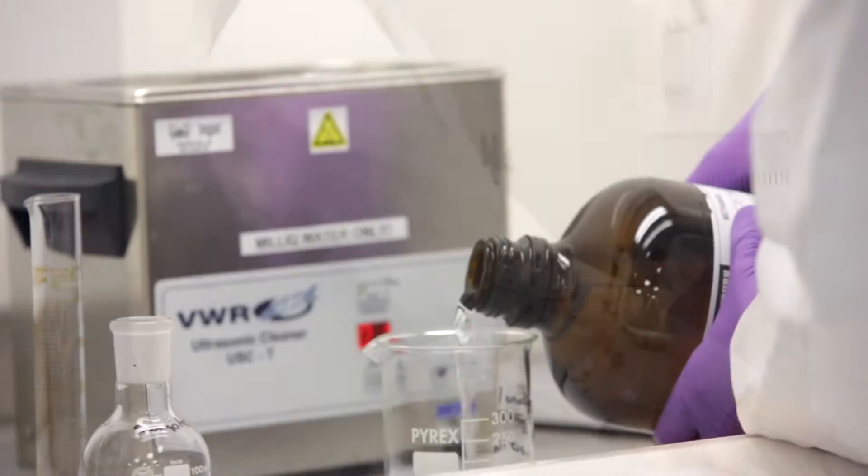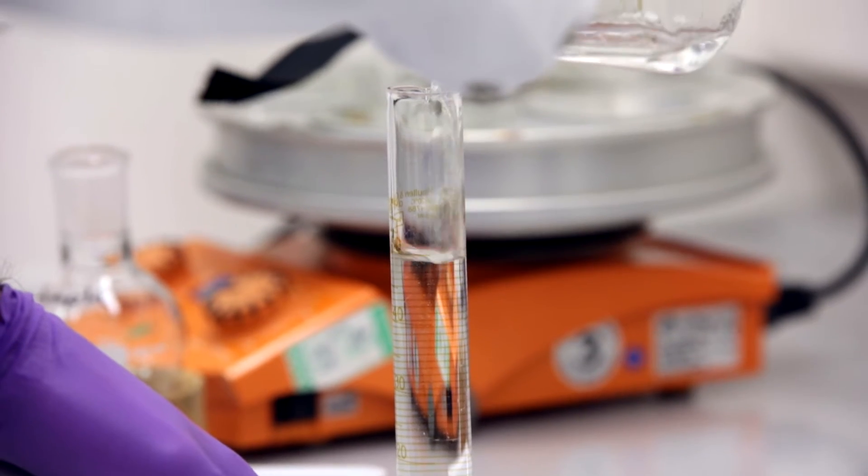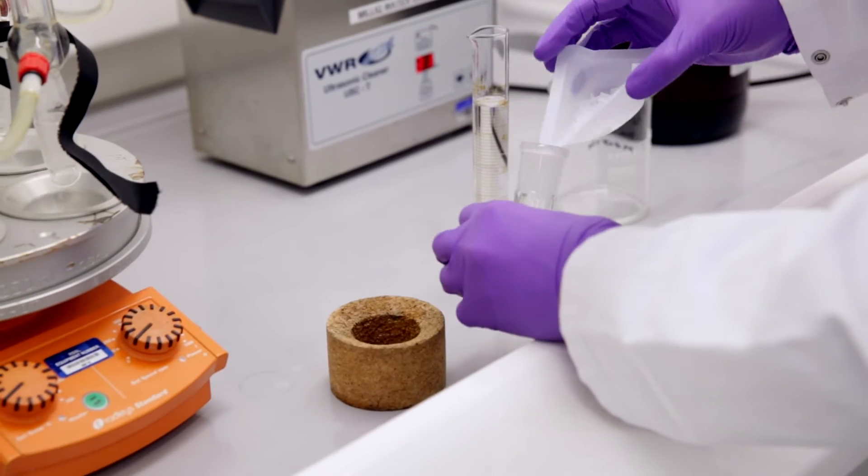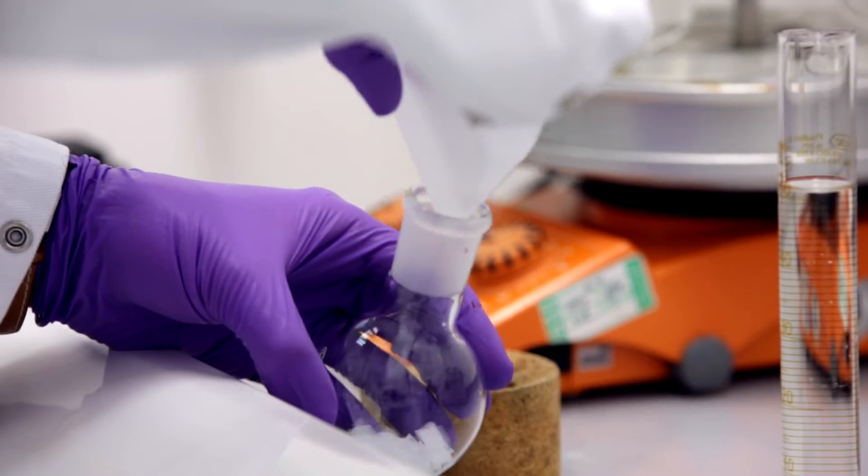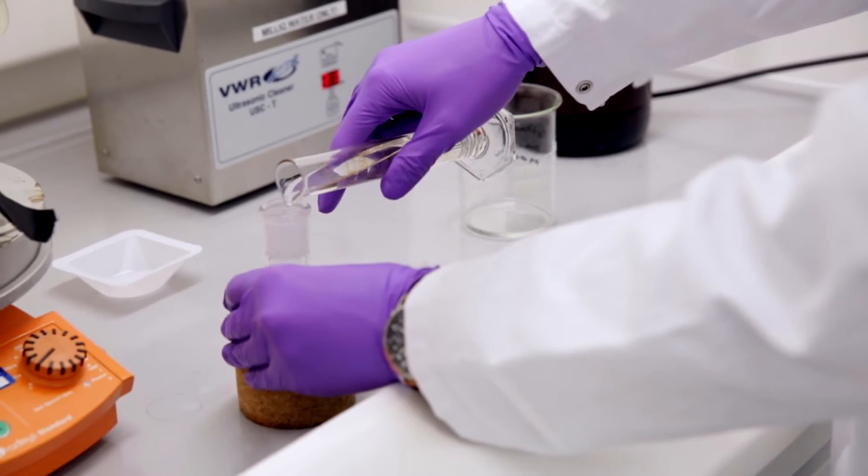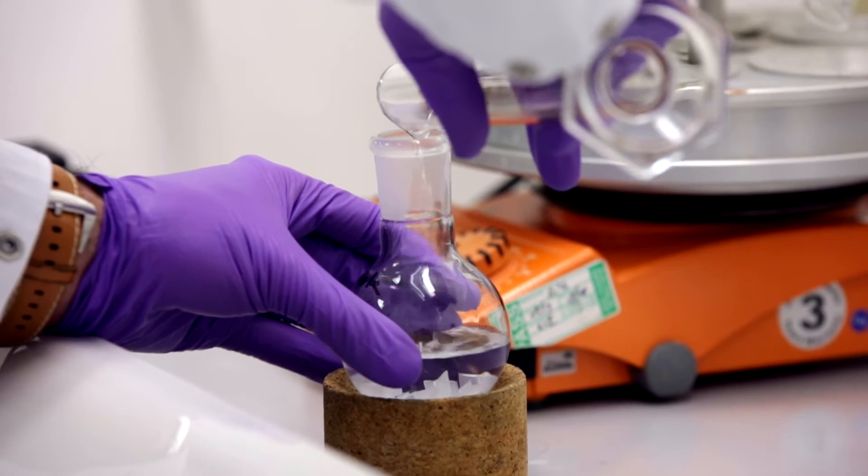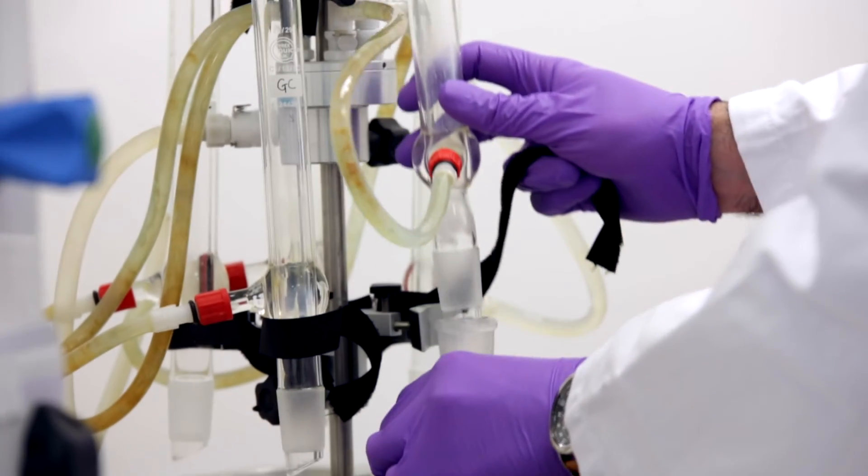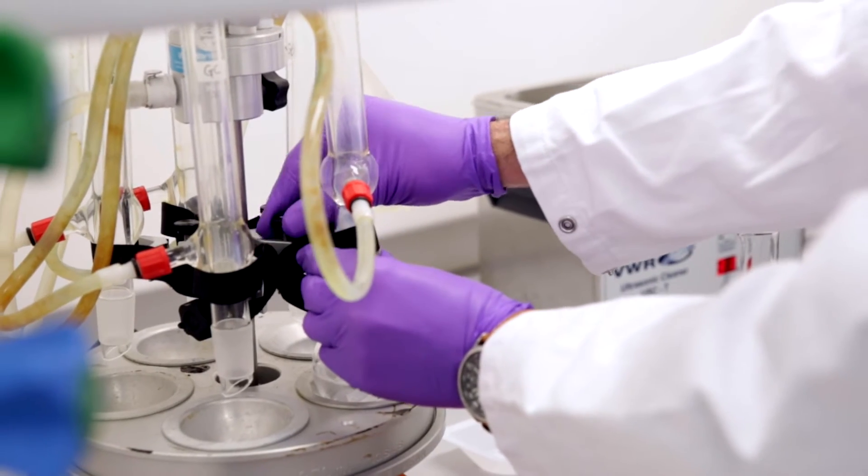The extractable study focuses on determining the chemical compounds present in the plastic cap that have the potential to leach into the drug product. To ensure complete extraction, the surface area of the sample is increased by cutting the cap into pieces. It is then subjected to harsh extraction conditions. These can include refluxing in different solvent combinations. We have the capability and experience to employ the most appropriate extraction techniques to recover all potential extractables from your sample.